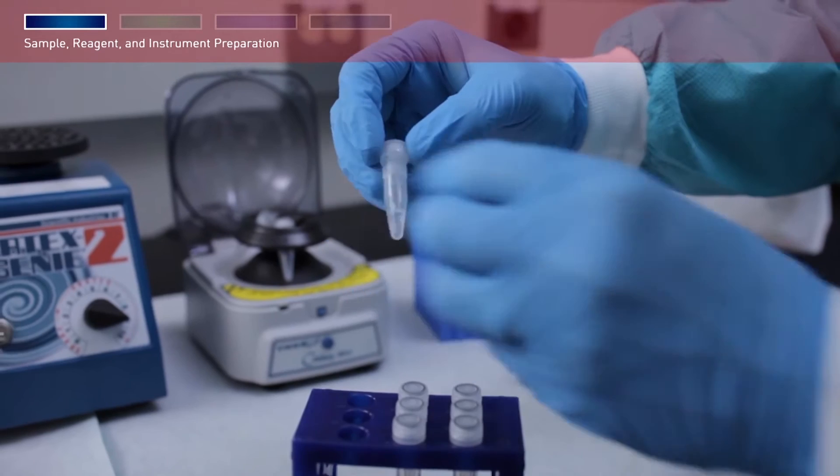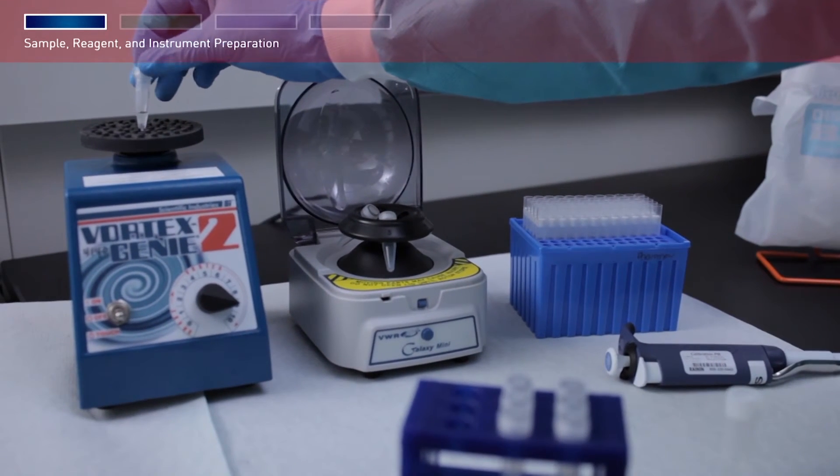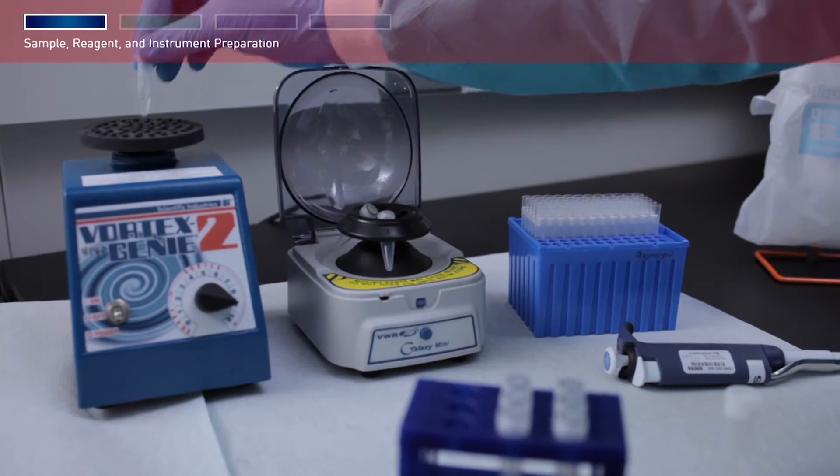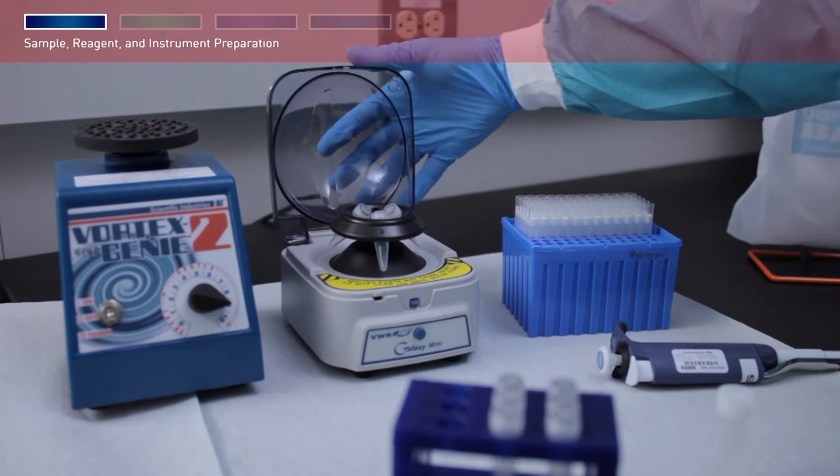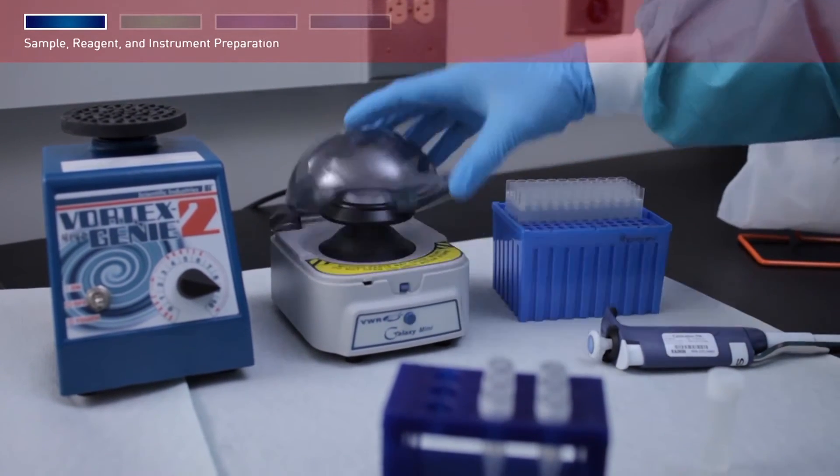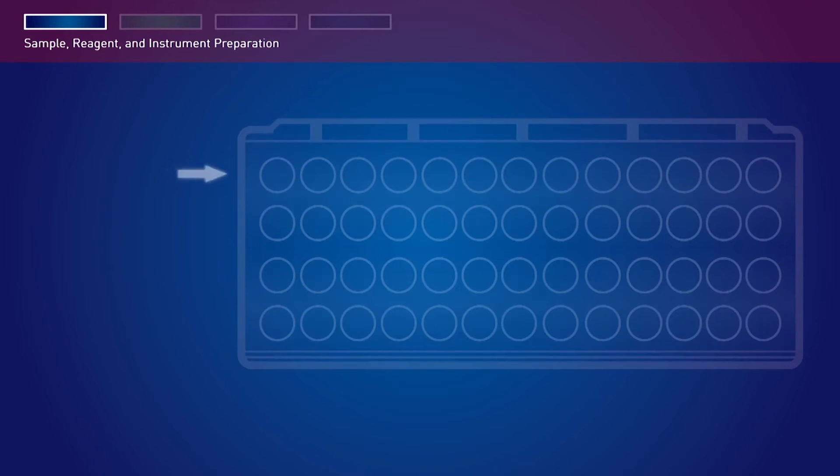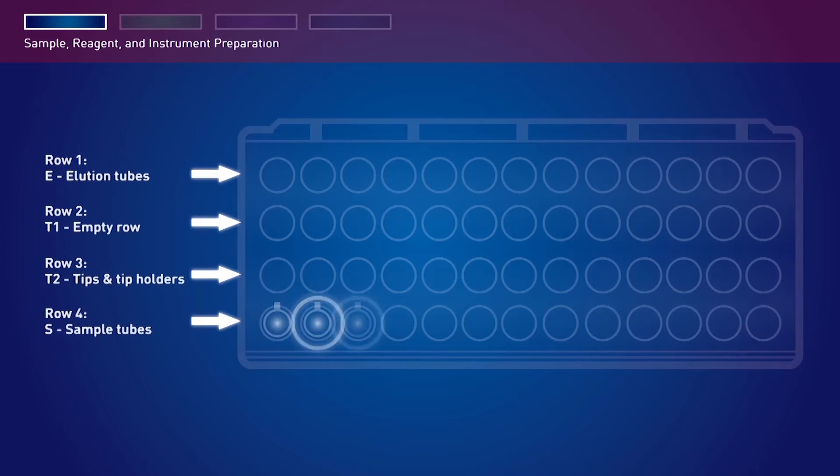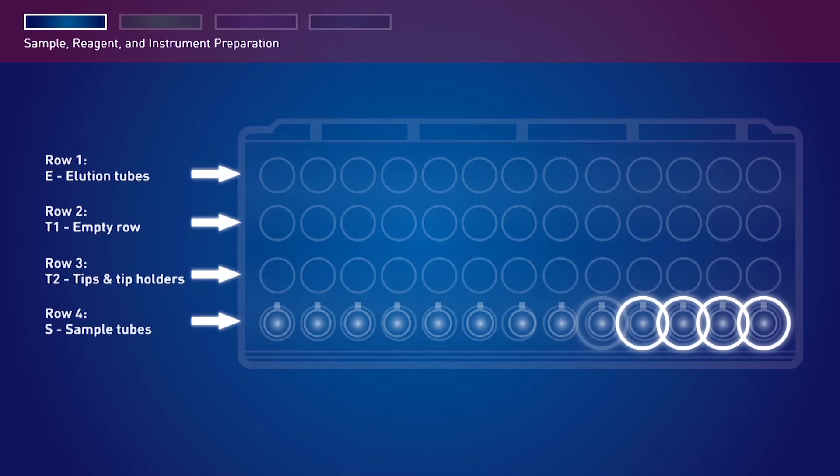Cap the tubes and vortex, then briefly spin to collect the samples to the bottom of the sample tube. Remove the screw caps and load the sample tubes into row S, fourth row of the tip and tube rack.